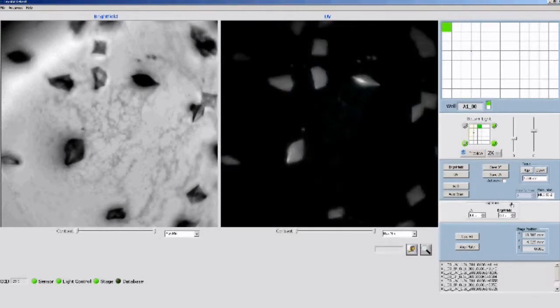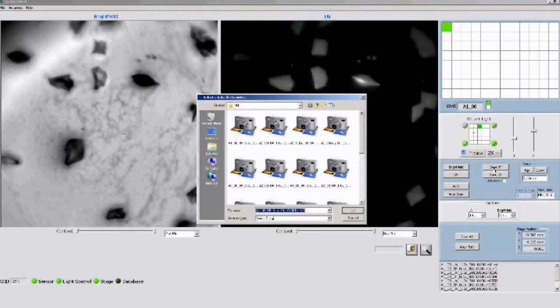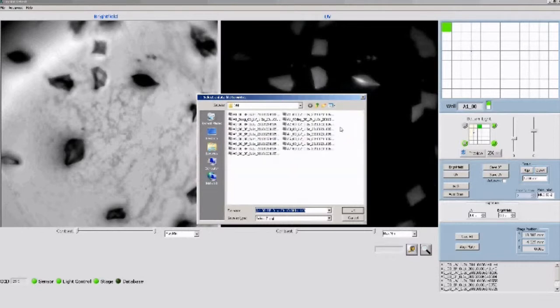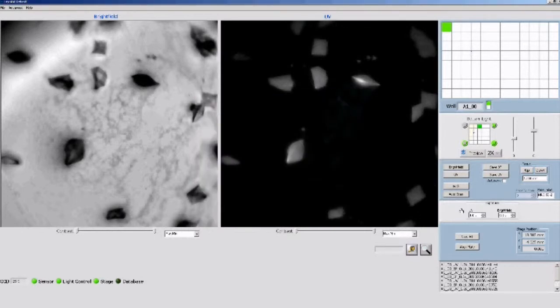Here is what we get with the 15X objective. There are features that are 4 to 5 microns visible in the UV image. The images can be saved individually or in pairs, or in the case of a complete plate scan they are saved automatically in a desired location.